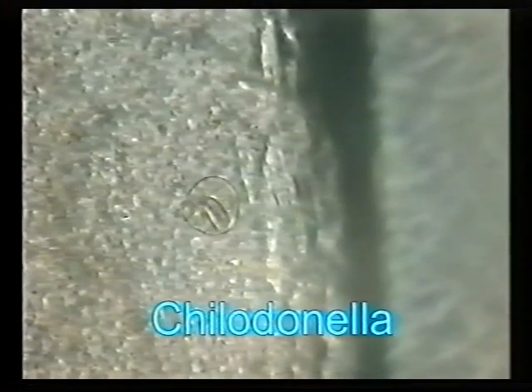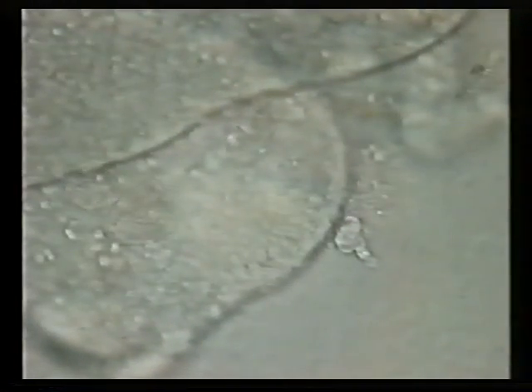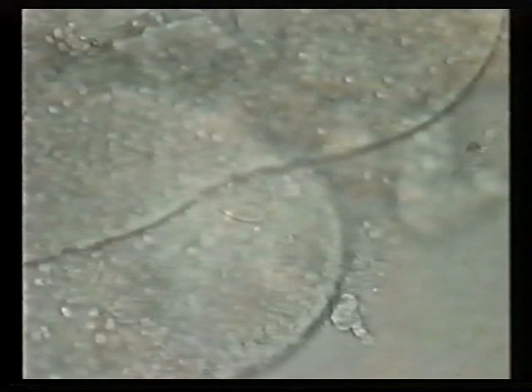Moving on to Chilodonella, these differ from Trichodina in that they feed on plankton and cellular debris which is sloughed from the fish's body, creating their own food supply. They are able to move freely both in the water and on the fish's body, and this enables them to move from host to host if necessary. To view them under a microscope, you will need approximately 200 times magnification to identify them. They can be very mobile.